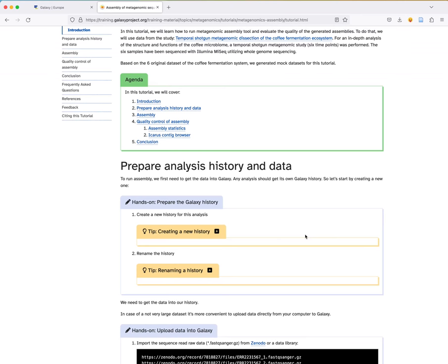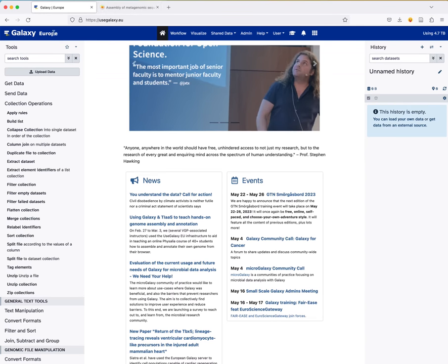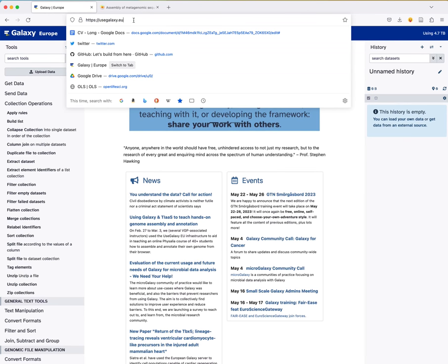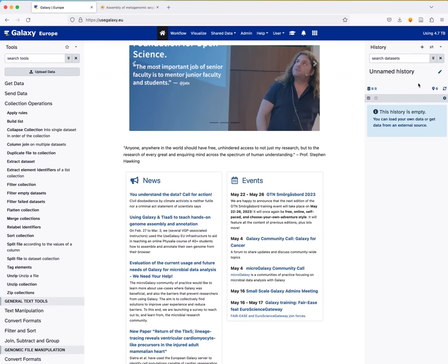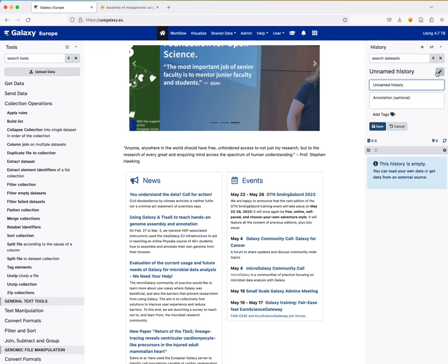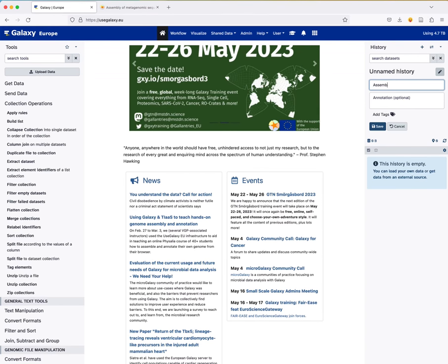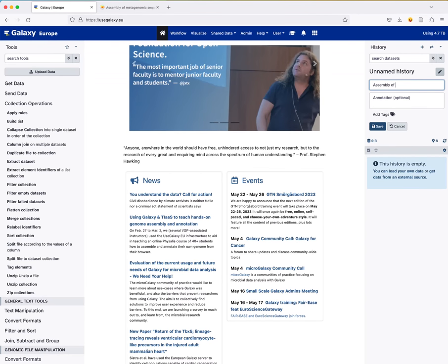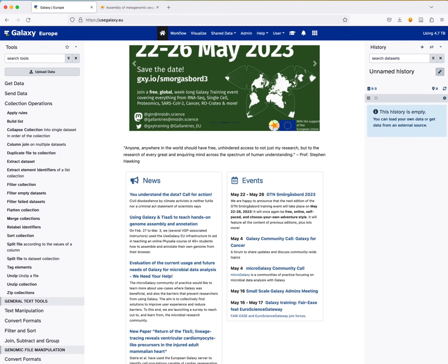So, how to run an assembly? First we need to get the data into Galaxy. Any Galaxy analysis starts with its own history. You go to your favorite Galaxy instance — for example, galaxy.eu, galaxy.org, or the Australian one. Create a new history by clicking the plus icon, then rename it. I'll rename mine 'assembly of metagenomics data tutorial.' Then I need to get the data.